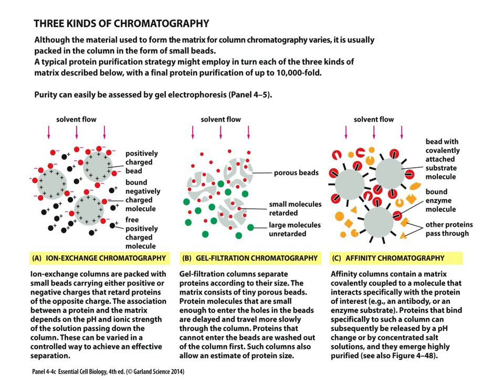So it would recognize those specific molecules that the antibodies are meant to recognize, or the substrates, which the enzymes would recognize. So other proteins, other materials would be able to pass through the matrix, but your protein of interest that the antibody binds would be trapped, right? So again, we could then add a solution that maybe changes the pH, so it would denature the antibody, not allow it to bind and release, or sometimes a high salt concentration is added. Different material, different solutes can be added that would release that bound.